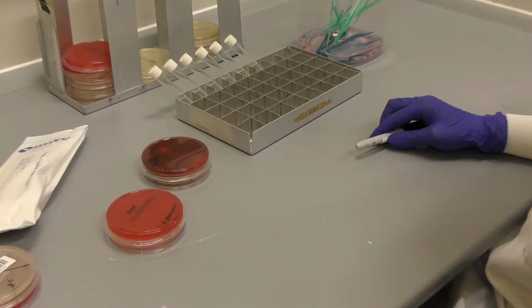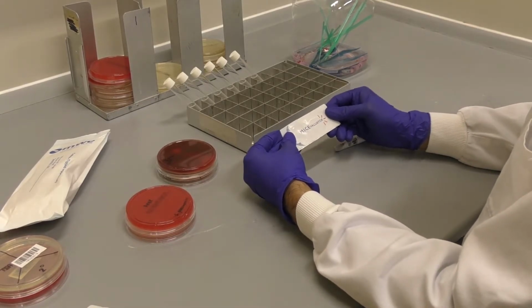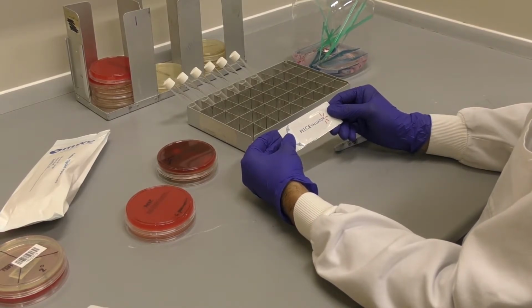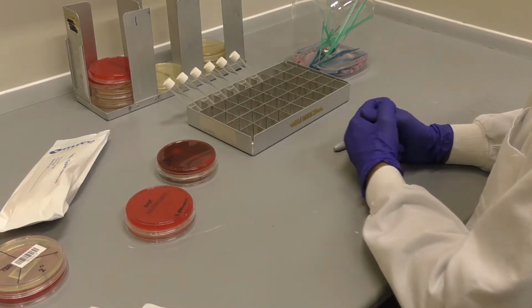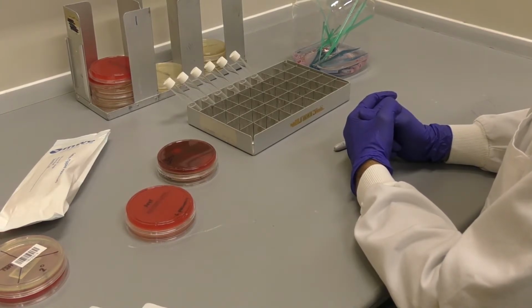You'll need to set up control plates every time you set up an E-test plate in order to help troubleshoot. And you'll need to allow the E-test strips to reach room temperature prior to opening. Make sure that the strips are protected from moisture, heat and direct exposure to strong light at all times. Ensure that moisture has not penetrated within the packaging or the storage container. Once the strips have reached room temperature, ensure that the moisture condensation on the outer surface is evaporated completely before opening the packs. Now onto the process.